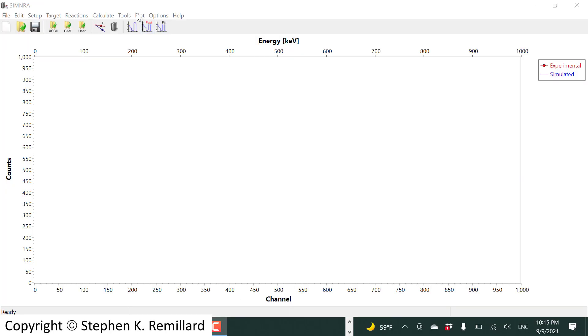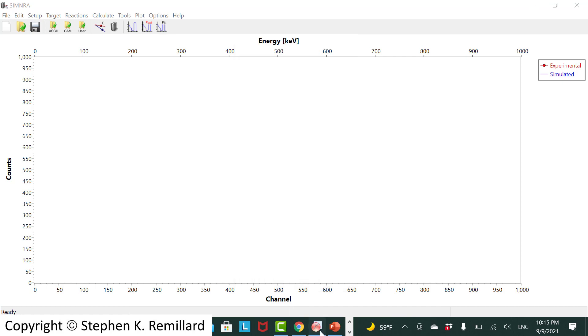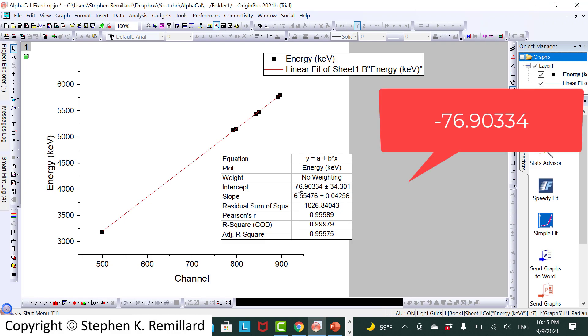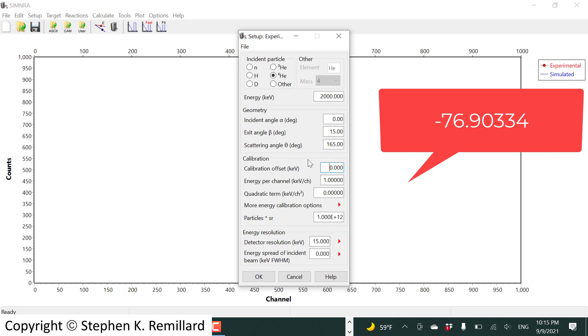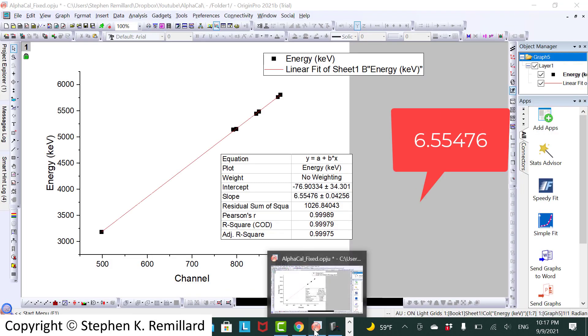In SIMNRA you put those numbers in right here. Calibration offset was minus 76.6978. Way more significant figures than should be allowed. And the slope is 6.55443.